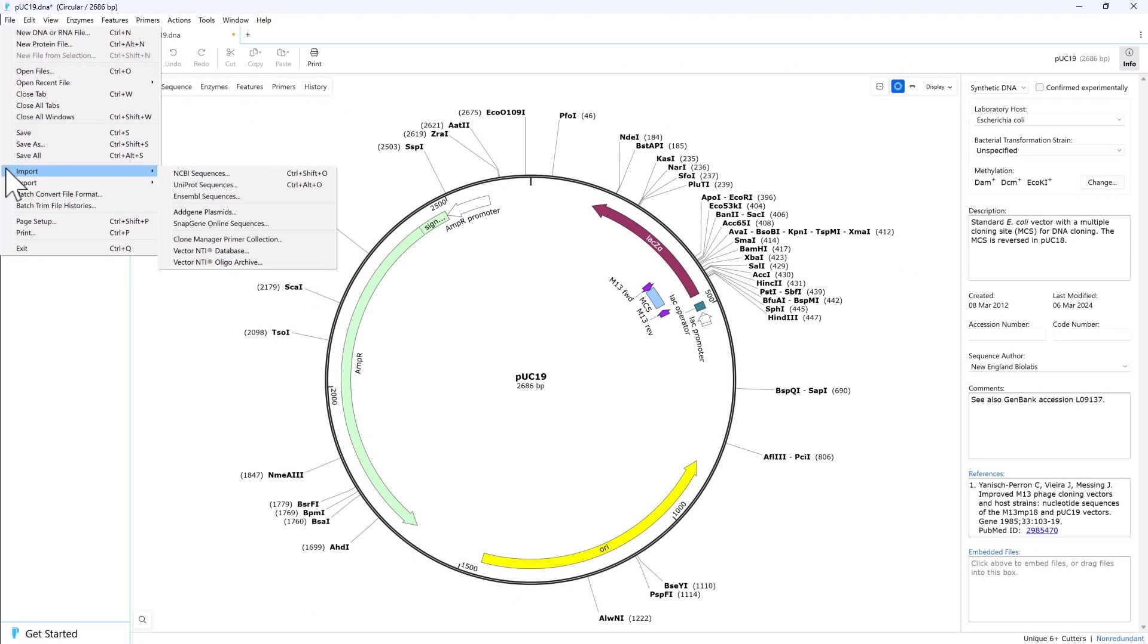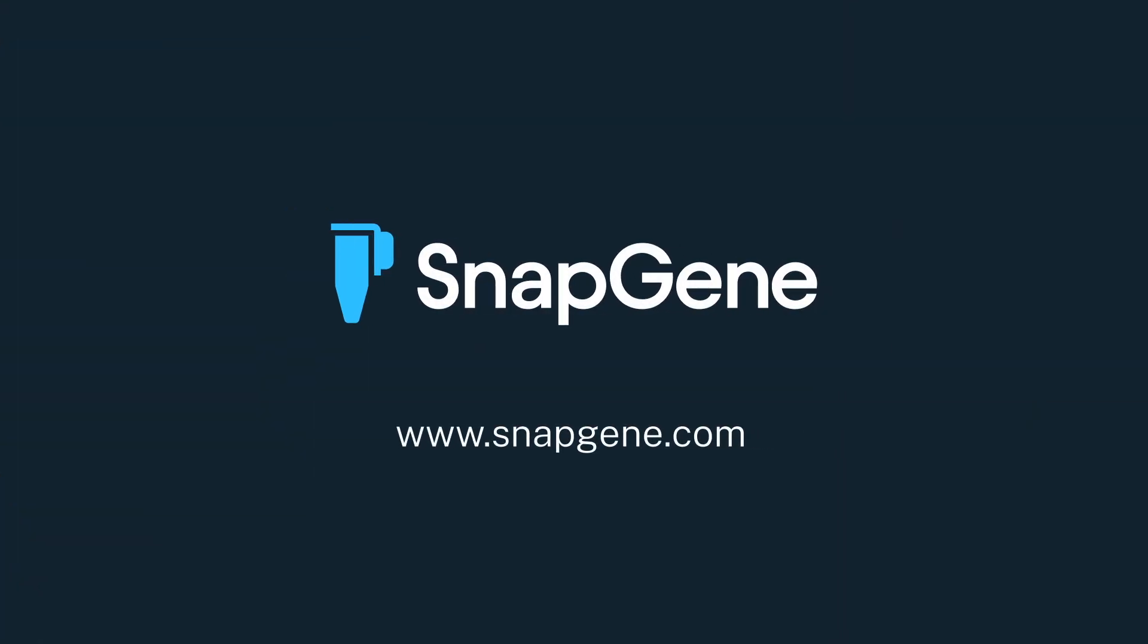And that's a brief introduction to using files in SnapGene. Watch the rest of the videos in this Getting Started series at SnapGene.com to learn more.